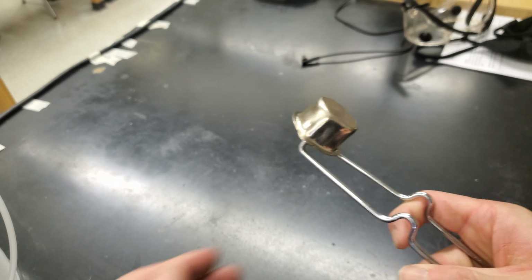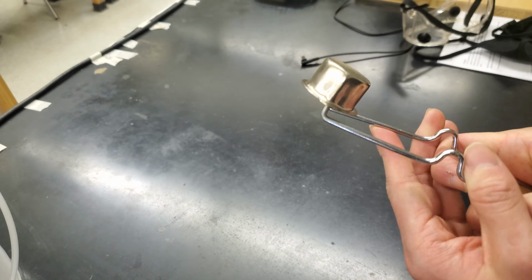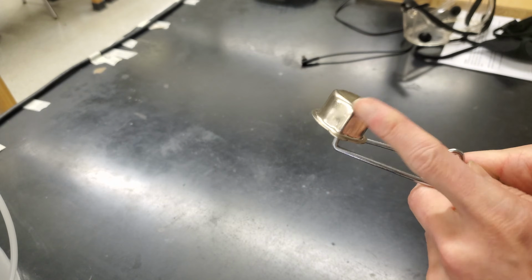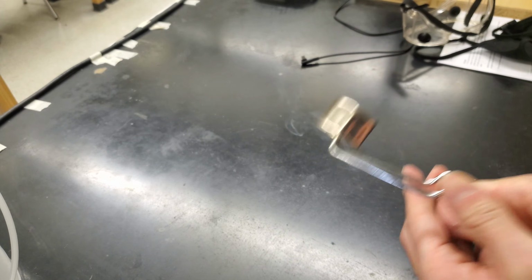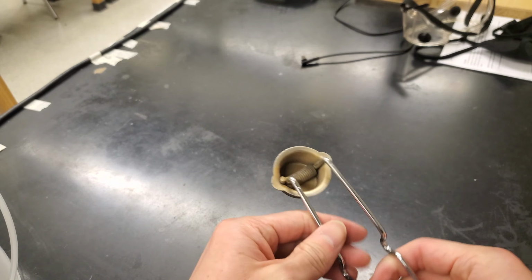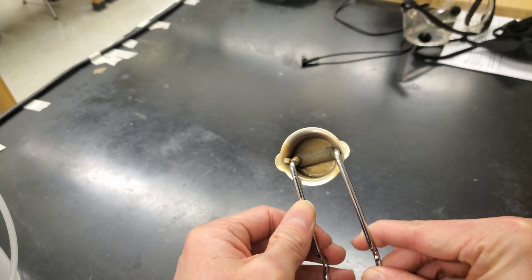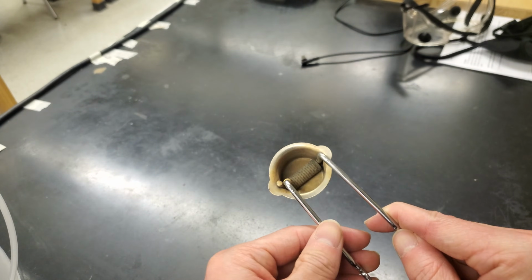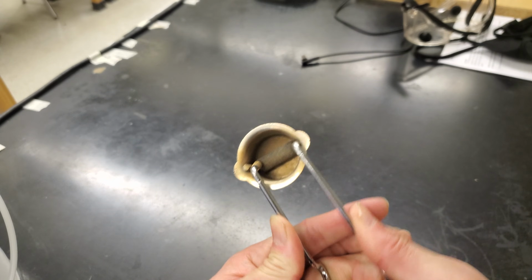And if you wanted to do it upside down, just like how we do it over the Bunsen burner, again, you're going to be pushing in towards the inside of the bowl, and then you're going to push it across, and that's what's going to give you the spark. So again, the key thing to using these strikers is you want to be pushing the stick in towards the inside of the striker, and that's what's going to allow you to get that spark, okay? Just like that.